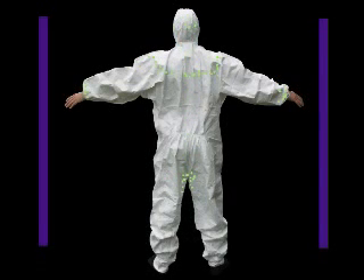Other combinations, including the Tyvek F suit, showed little or no leakage.